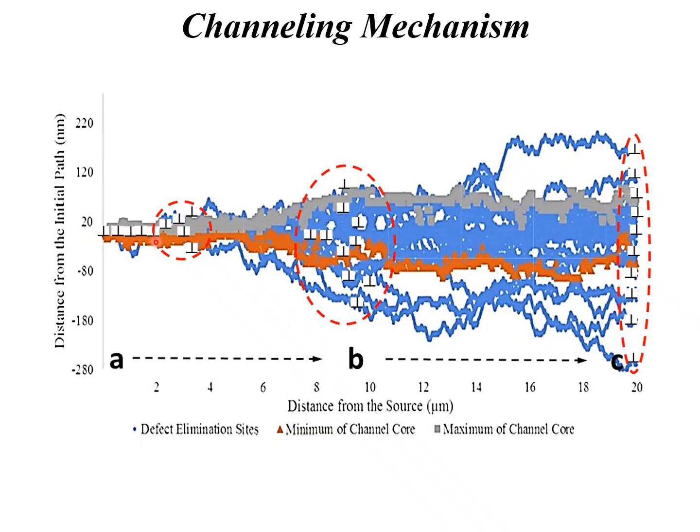But the more they interact with the loops, they climb. So you get this climb of the dislocations, and the dislocations continue. Now, as they continue through the matrix, they climb even further, and you get a distribution of dislocations which is non-planar. And eventually you'll get much more alignment of the dislocations.